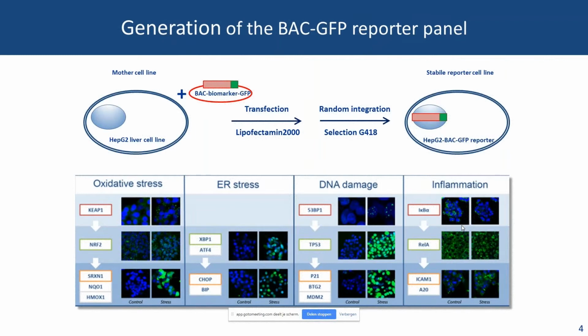At the C terminus, right before the stop codon, we clone in a GFP sequence. So whenever the biomarker is expressed, the GFP will also be expressed, and a GFP fusion protein will be formed. This is very important, because in this case, we can see not only how much of the biomarker molecule is available, but also where in the cell it's located.